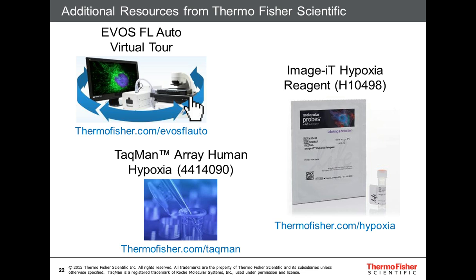Now, whether that is enough to confound your readout is another question, but I think that, provided you're using validated reagents that are demonstrated to really be specific for HIF-alpha via Western blot, you may need to consider exactly how your extract is being prepared, or include some sort of inhibitors in your lysis media.